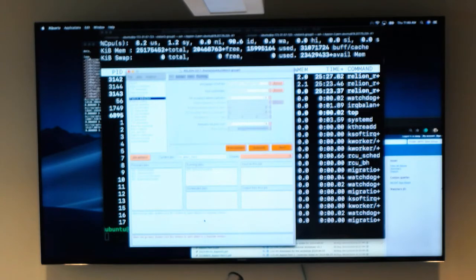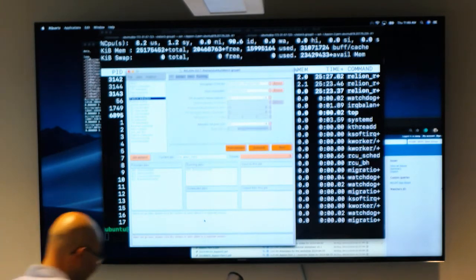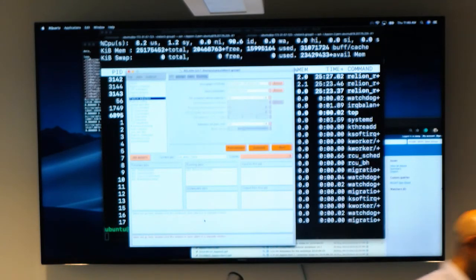Anyone stuck somewhere? Good, that's a good thing. So let's unstick. Okay, so there was a typo in the instructions because it's actually boxes instead of box. You can run classification afterwards too, but we have to select good classes.